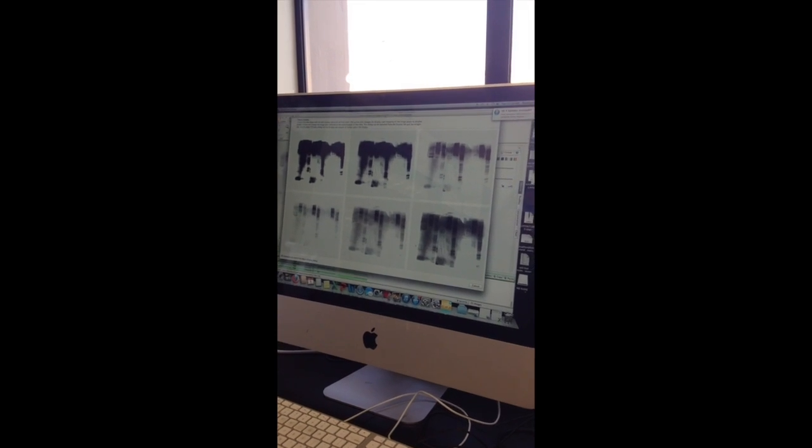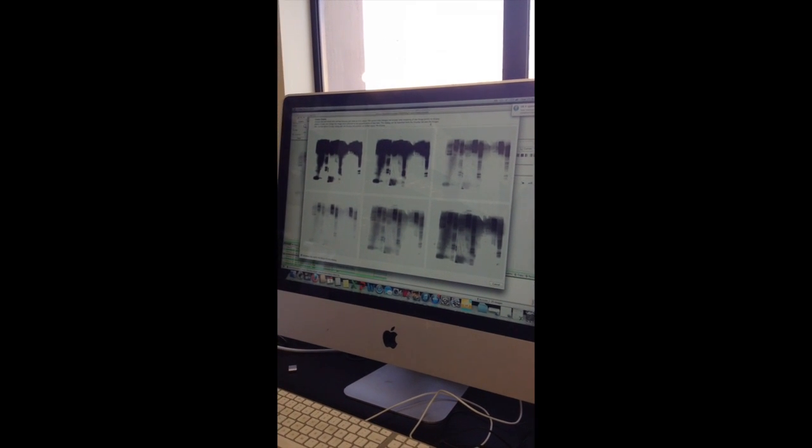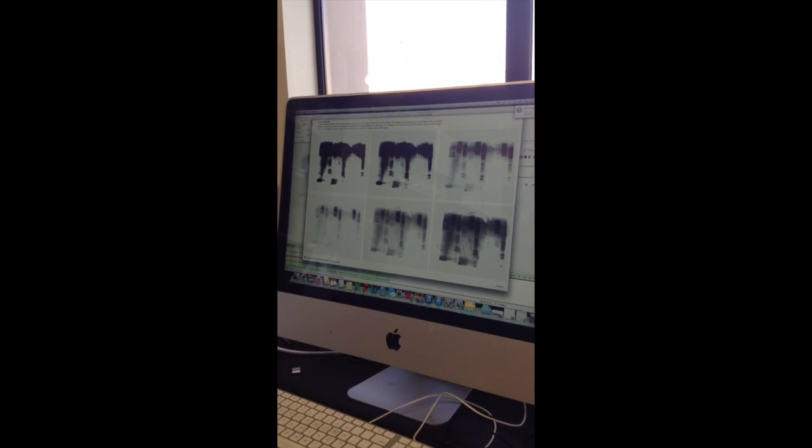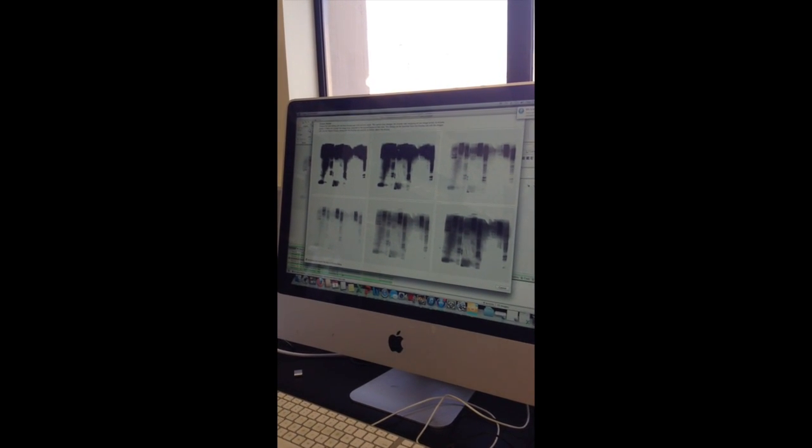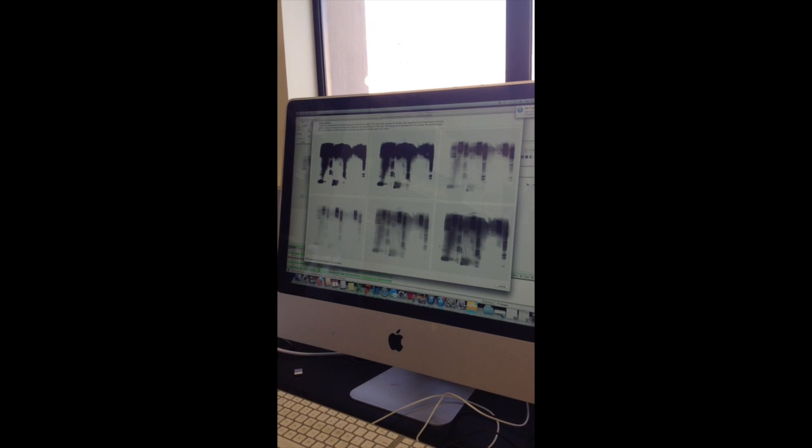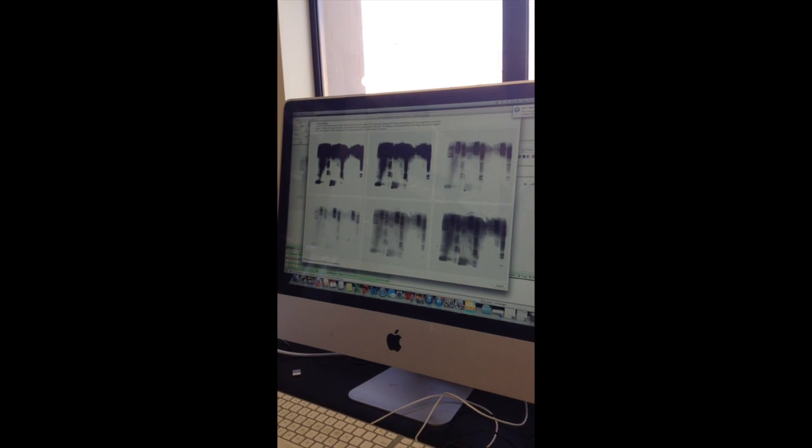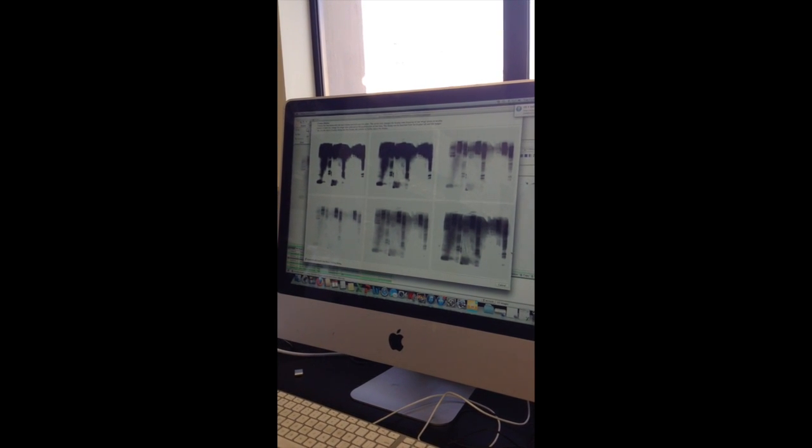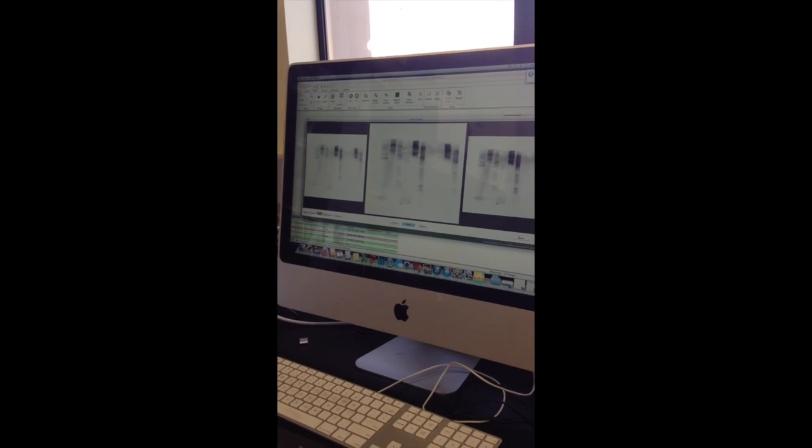Thank you. After the C-digit has finished scanning, you'll get a screen display that will have different contrast of the blot, and you can choose the best looking one as your main one.